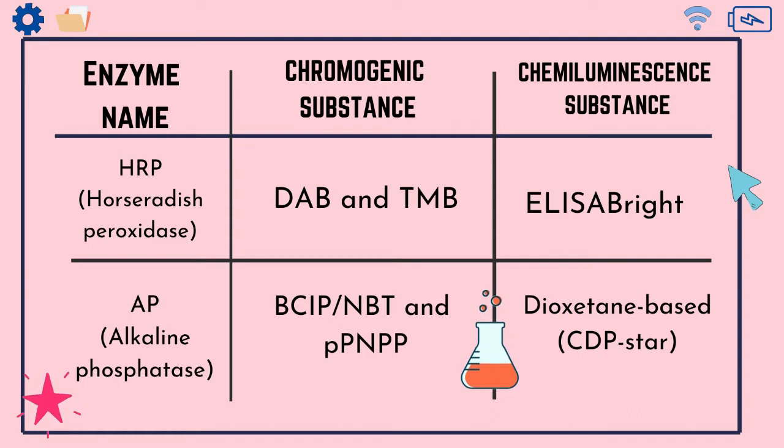The broad linear dynamic range can enhance detection and precision. The immediate light generation can cause fast detection. It is also cost-effective because it reduces reagent consumption.